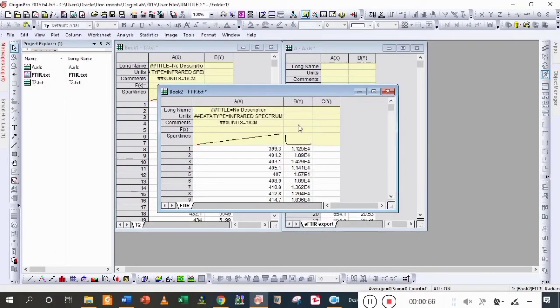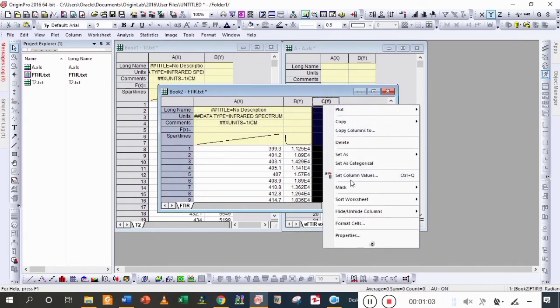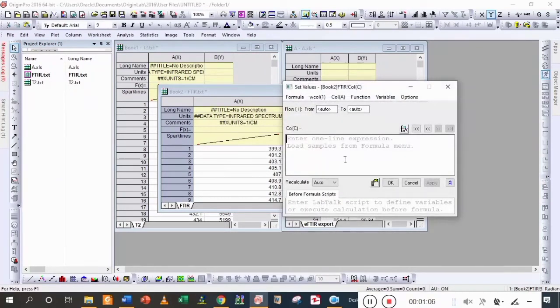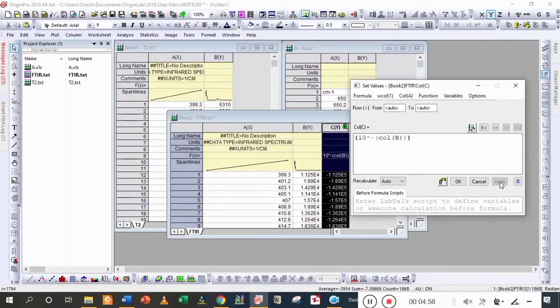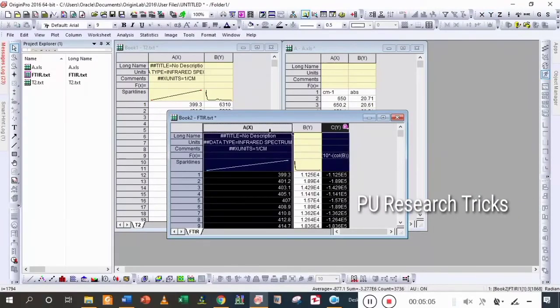Select all, and then set column values. Here you can write the formula in f(x): equal to 10 to the power of minus column B — which is the intensity column — then close the brackets and multiply by 100. You can see that we have observed some new values. By using these new values we can calculate the transmittance data. Note: don't forget to include the 100 in your formula.